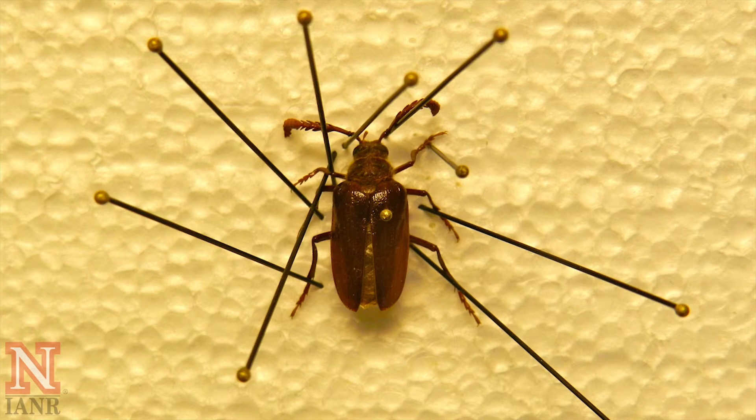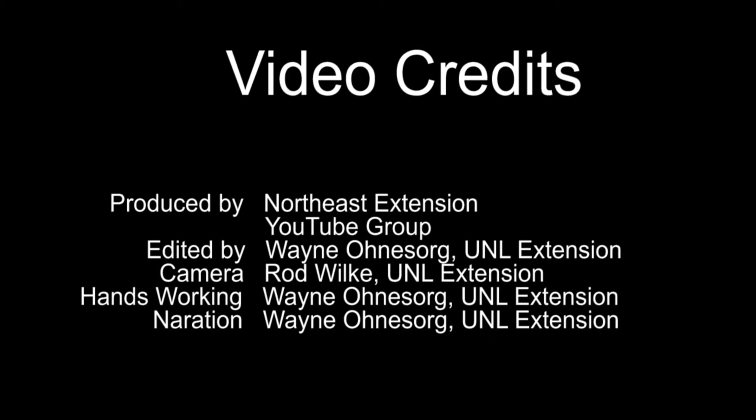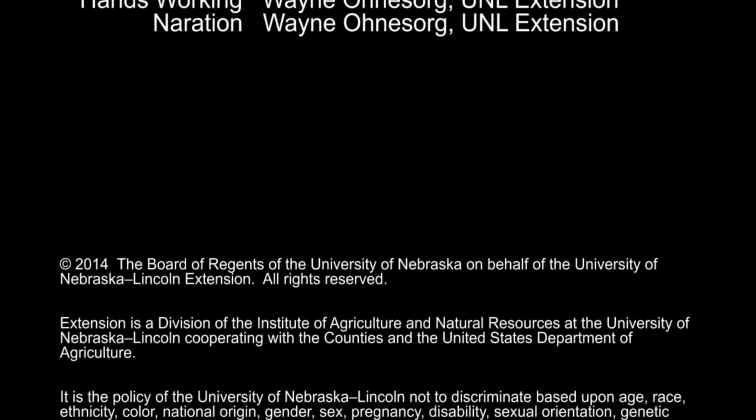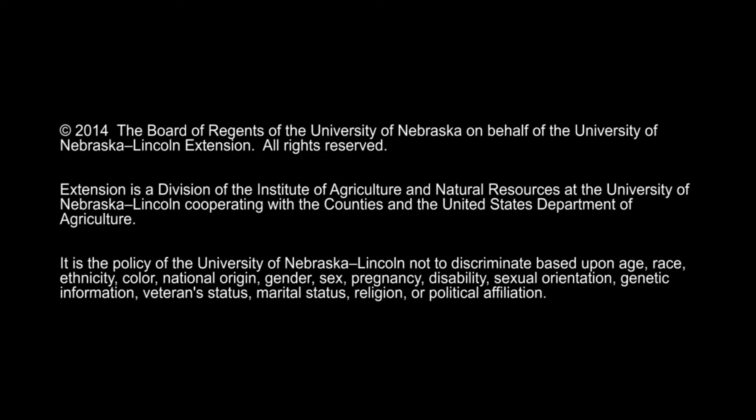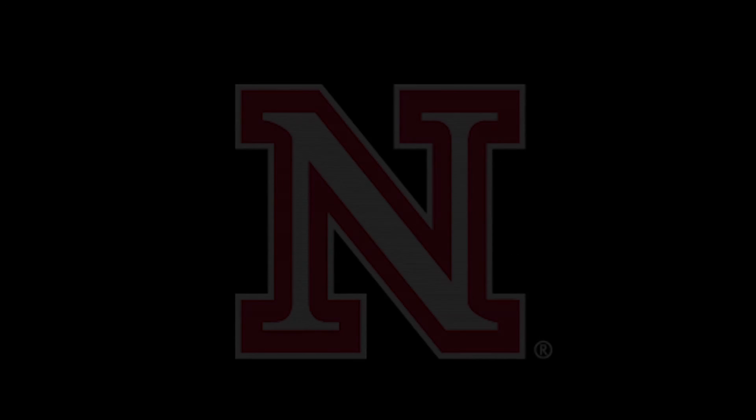This is what your finished product may look like.